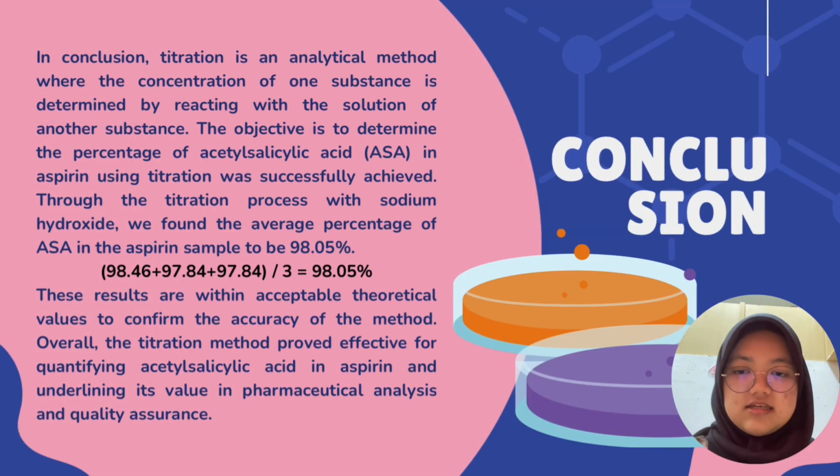The last slide is the conclusion. In conclusion, titration is an analytic method where the concentration of one substance is determined by reacting it with the solution of another substance. The objective, to determine the percentage of acetylsalicylic acid, or ASA, in aspirin using titration, was successfully achieved.